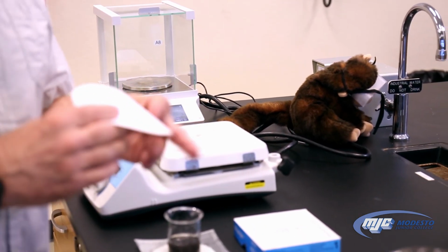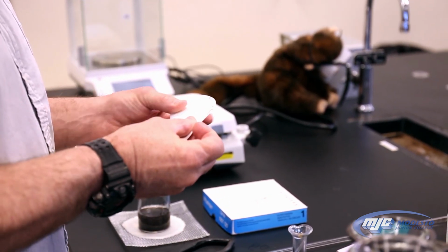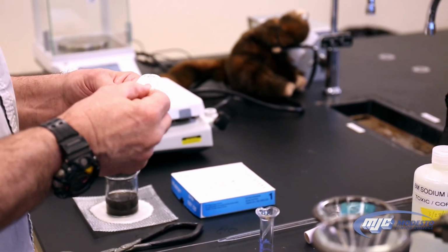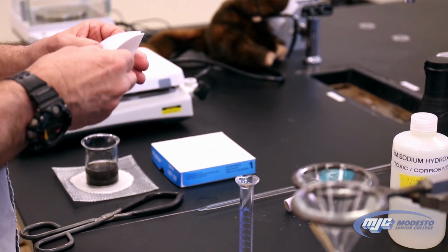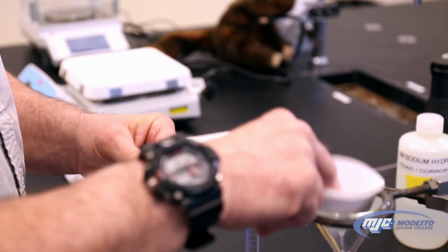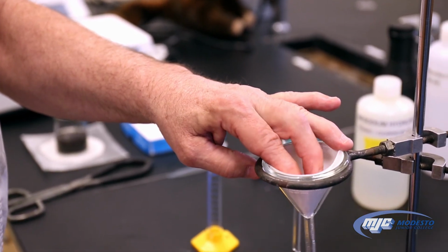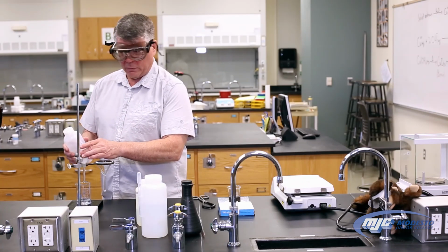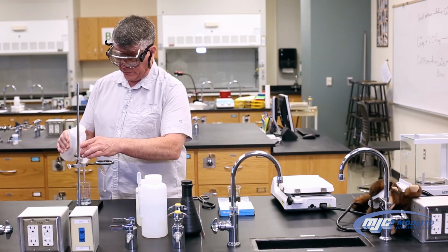Fold it up just like before. Fold it in half. Fold that in half again, with the writing on the outside. Open it up this way. Place it into our funnel. Get the filter paper wet, so again, it doesn't come up off of the funnel.